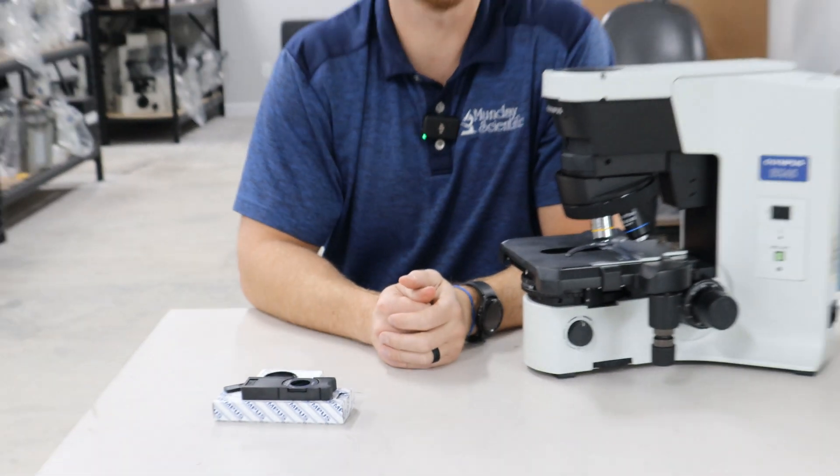This is the BX45 microscope. It's an excellent microscope made by Olympus. It's very popular for pathology and cytology.